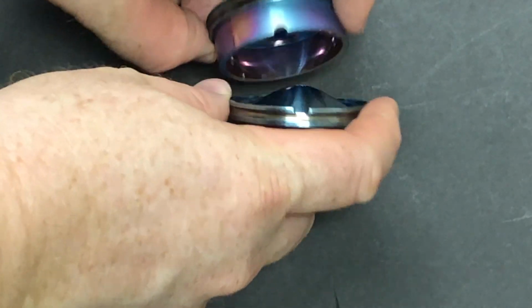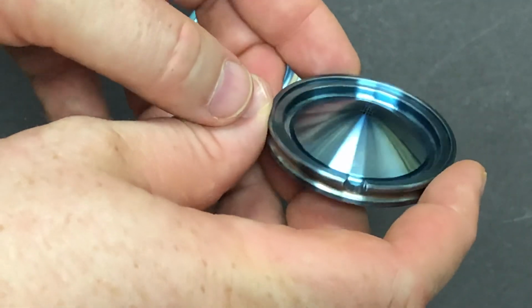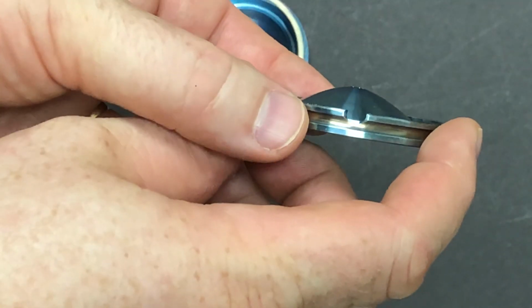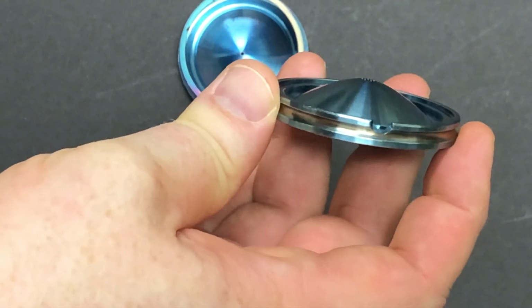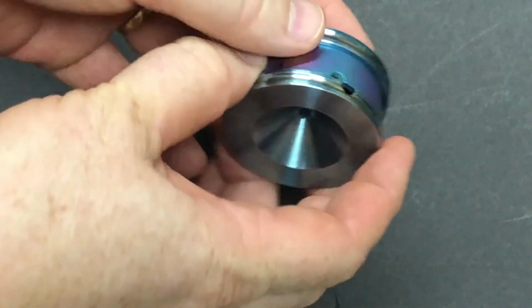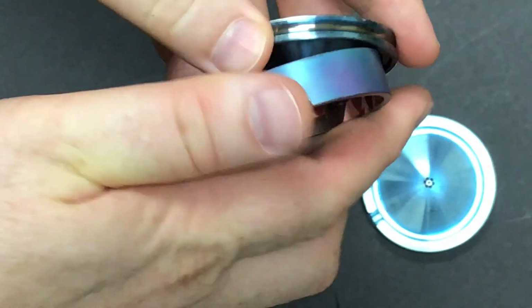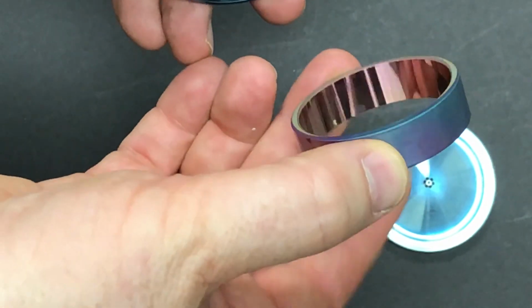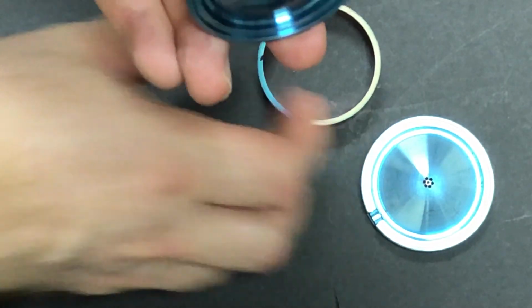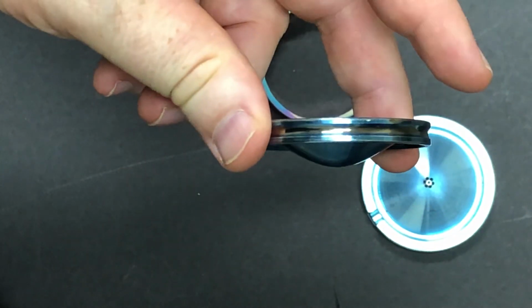So let's take it apart. There is the first end cap where the ions would enter in, and you can see it's got that rounded shape. So the ions essentially see it as a quadrupole. And we just have empty space in the middle because we want to keep the ions trapped in the middle of this trap. We don't need them running around a racetrack. We're going to keep them trapped in the middle. So this ring electrode is just going to facilitate the end caps, holding them in the middle. And then there's that pinhole in the other end cap.